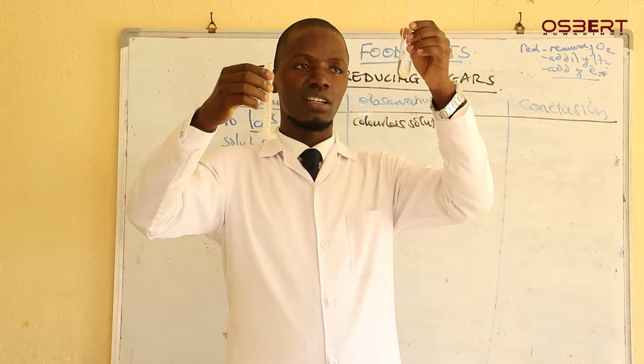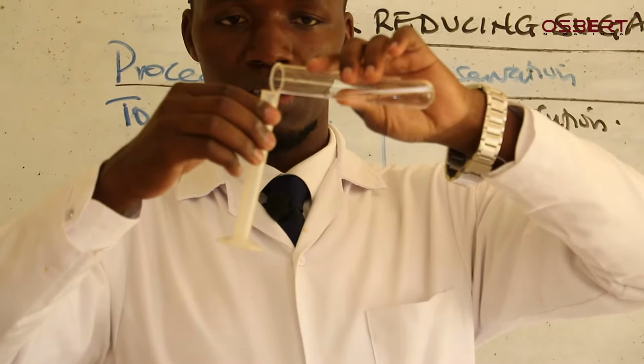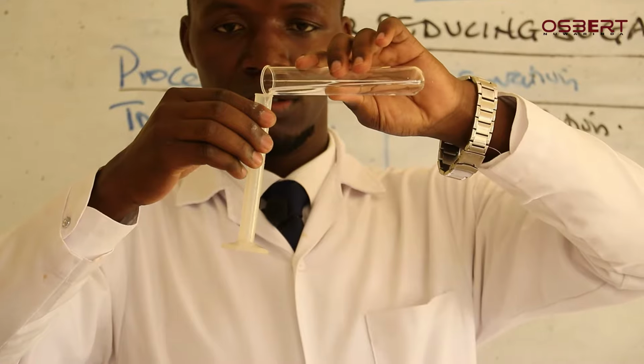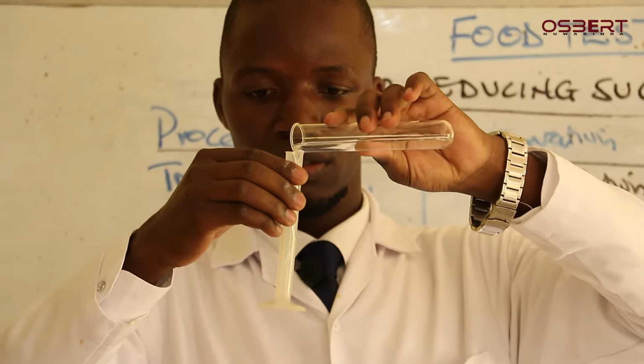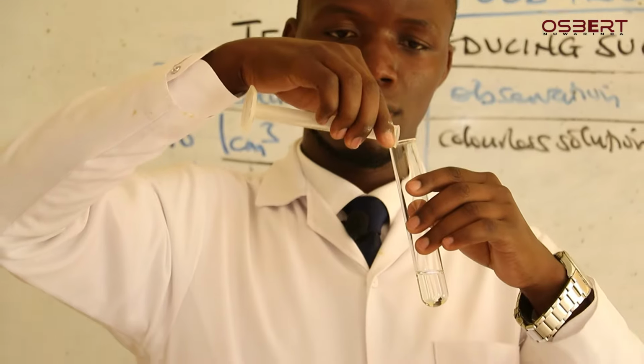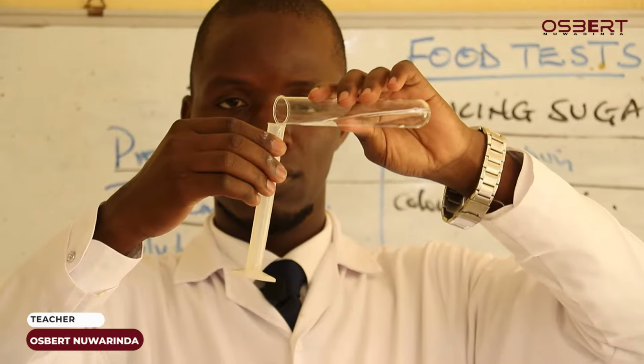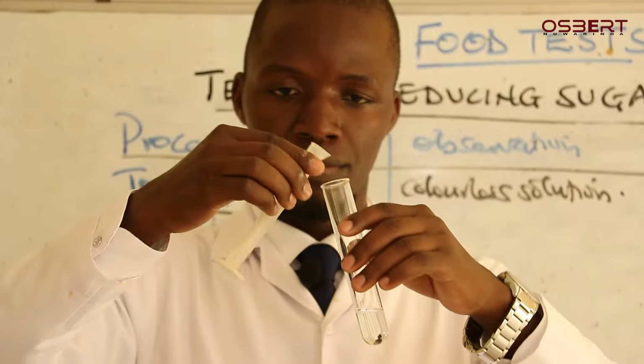I'm going to measure 1 centimeter cubed. This is a lot. So I'm going to measure 1 centimeter cubed. Sorry.